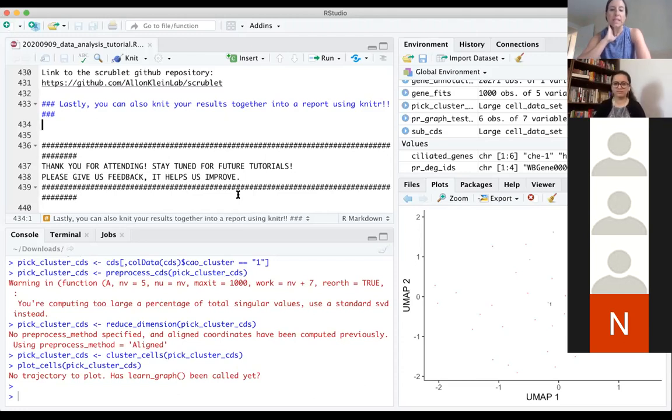So Aishwarya, here's a question. Can you clarify when you would use regression analysis and graph autocorrelation analysis? Yeah. So regression analysis is basically used when there is an individual variable in your dimensionality reduction.